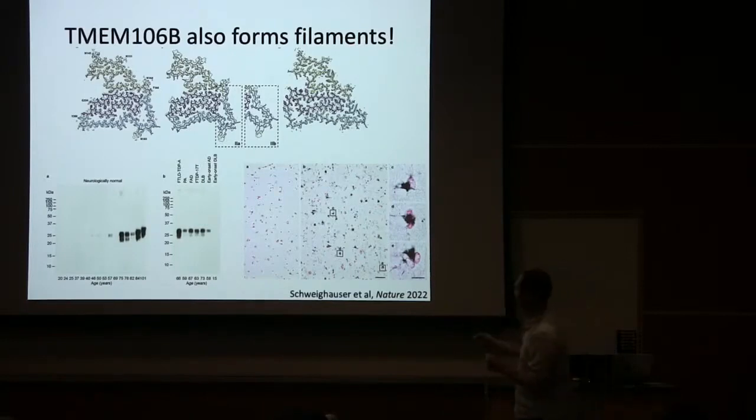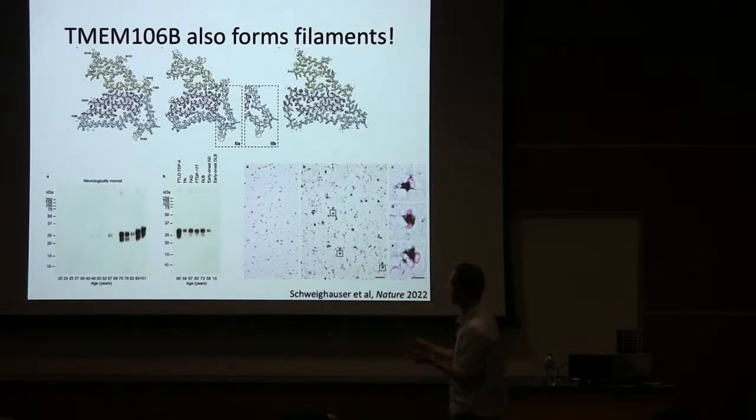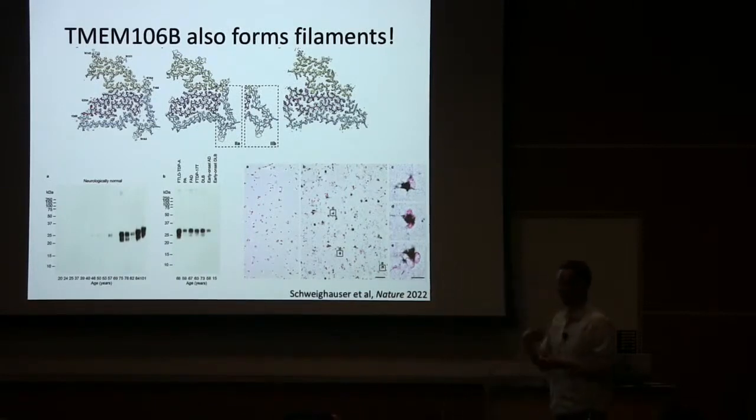We hadn't really understood, because normally these densities are linear. You have an N-terminal part of the ordered core, and then it can do whatever complicated things, and then it comes out at the C-terminus. This structure had a cyclic kind of density in it. So we thought, oh, perhaps our reconstruction wasn't really right, but we hadn't found out. But then it turns out there's actually an intramolecular disulfide bond in TMEM106B, which beautifully fit into place. So that was one of these familial tauopathies.